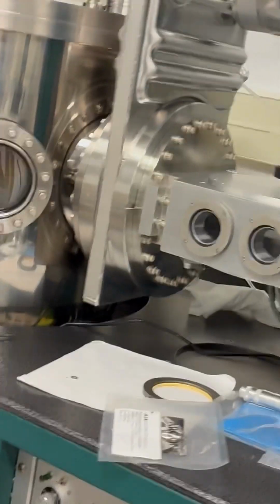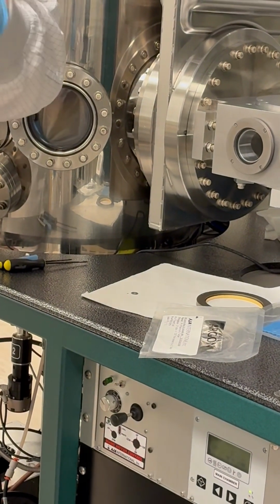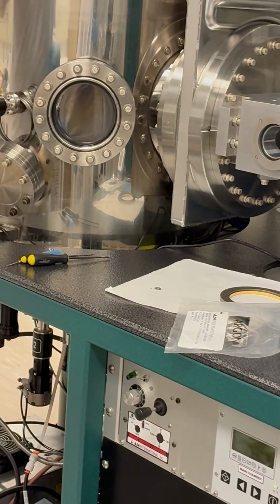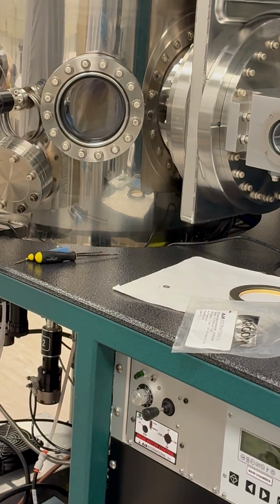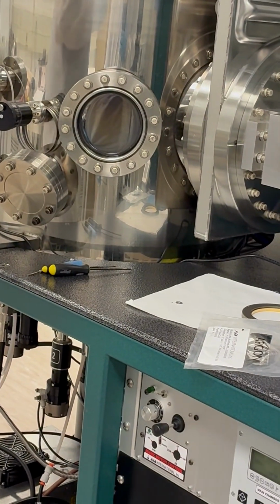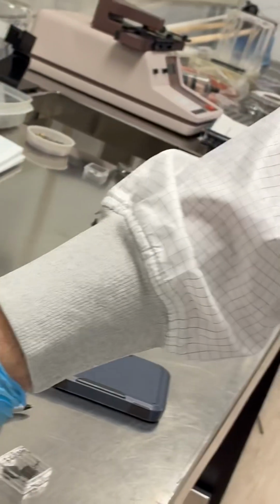And so what I did was I pumped up the tooling factor to as high of a number as I can. I told the tool, your QCM, it's way up here. I was lying, right? And because of that, it says, hey, I'm seeing a growth rate that is 0.19 angstroms per second.